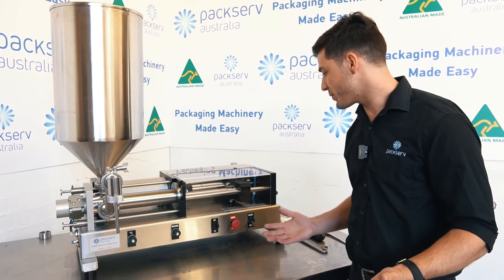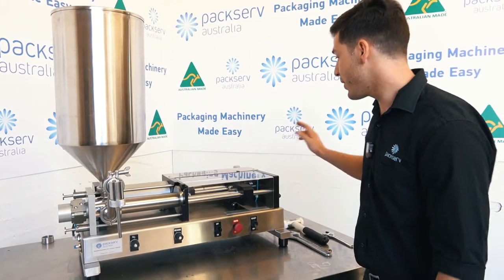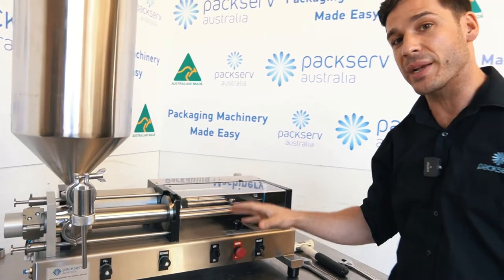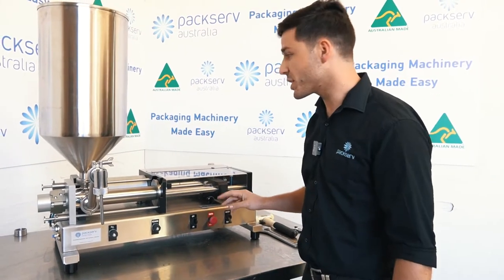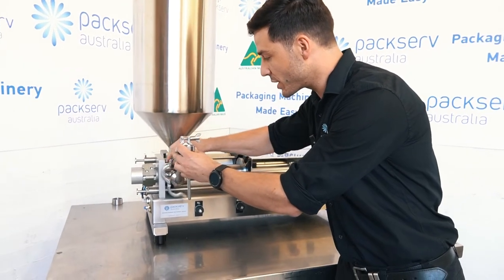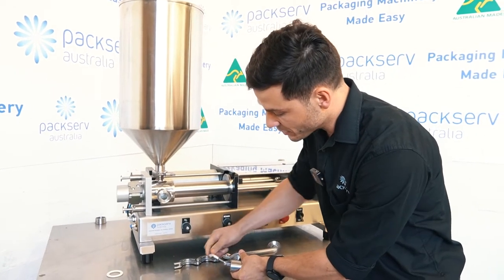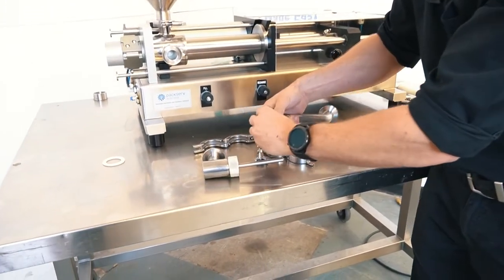Hey guys, Andre here at PacServe. Just going to give you a quick rundown on strip down and disassembly of all the wet parts on our PFM3 filler. First thing I'm going to do is make sure the air is switched off and disconnected, and that the machine has been flushed with no remaining product. I'm going to loosen these triclover clamps here one at a time, making sure I can get the seal located between each one. Just twisting anti-clockwise, it's going to come off like that and everything will just come apart nice and easy.